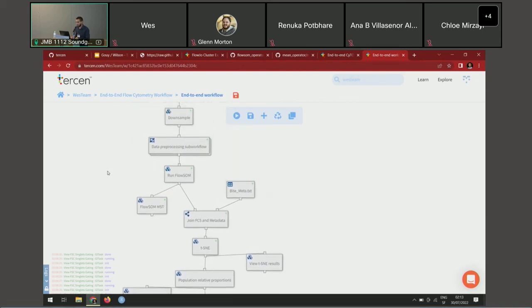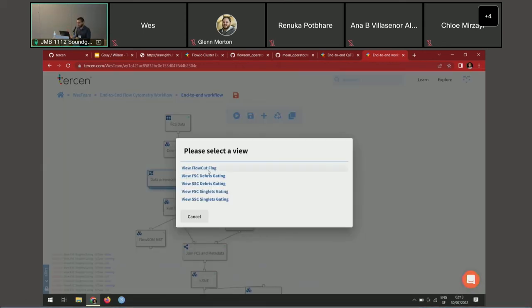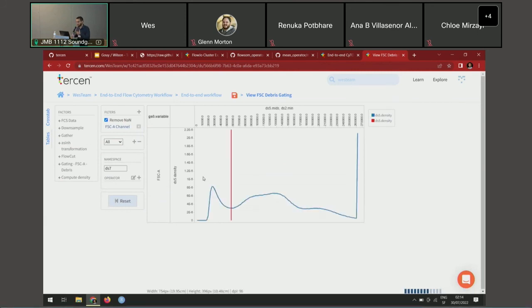That makes sense. These workflows are intimidating, but we can hide them into sub workflows like this and just surface the relevant metrics, and then train the immunologist to look at the gating here. Does it look good to you or not? Is it too stringent? If not, you can tweak this parameter. So that's one way of doing it. We can hide some of these things and templatize them. They have a given input data set, and we have a template that runs everything.